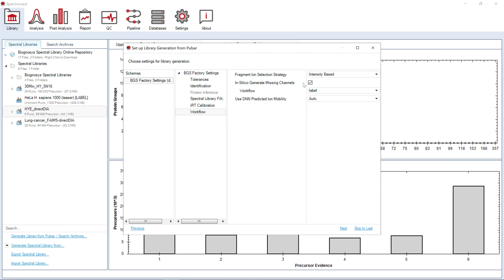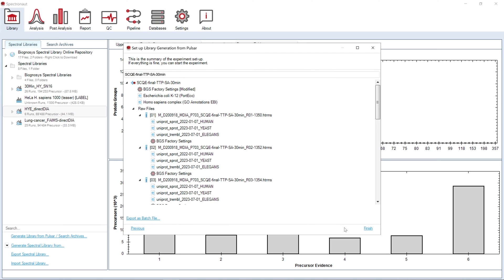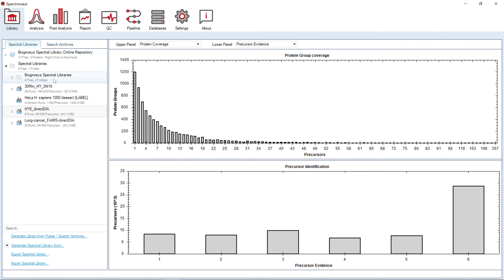The last page shows an overview of the whole experiment setup. Clicking finish will start the experiment. As soon as the library is generated, it will appear in the library tree.